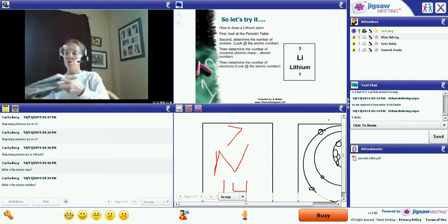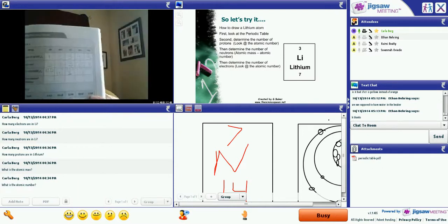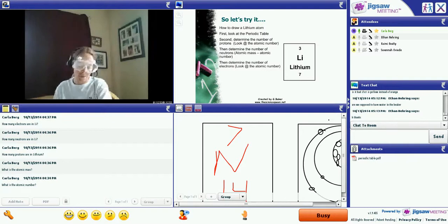When you do that, in your data table 4.1, you are going to put an X in the correct column, or in what your data shows as correct, as the well with the most precipitate. So the well that is the darkest brown.